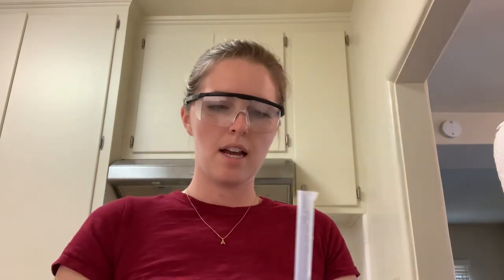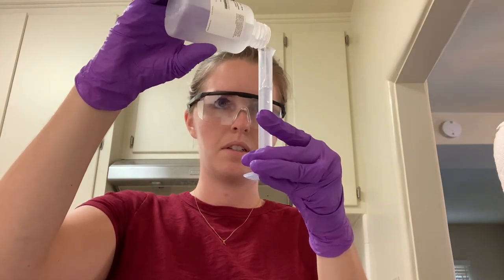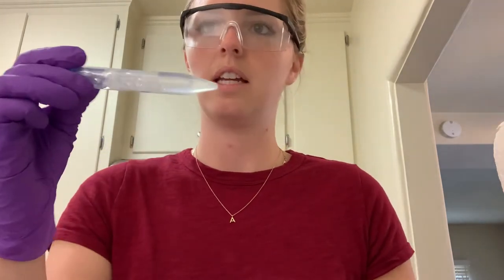For all the dilution tubes — ten to the one through ten to the five — we're going to measure nine milliliters of PBS liquid. Take the graduated cylinder, measure nine milliliters, and pour that into each of the other tubes. Each of the five tubes gets nine milliliters, and I now have all five filled.